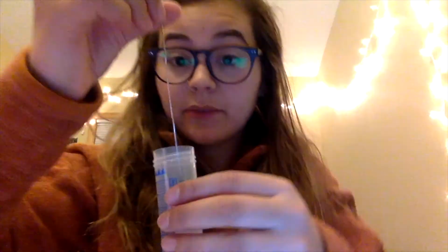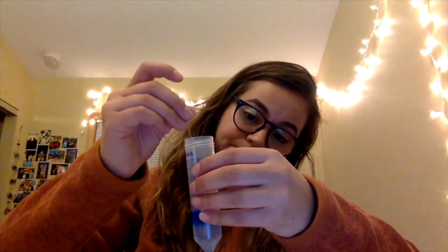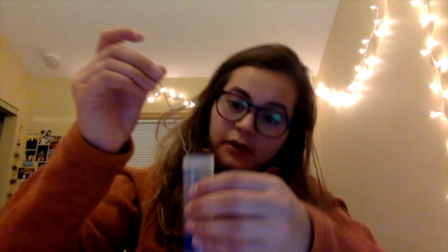So I have some here, so I'm going to show you. Hopefully you can see. So do you see those blue kind of threads around the paper clip? That's our DNA. So keep twirling, see if you can get a little more. But yeah, pretty much there you have it.